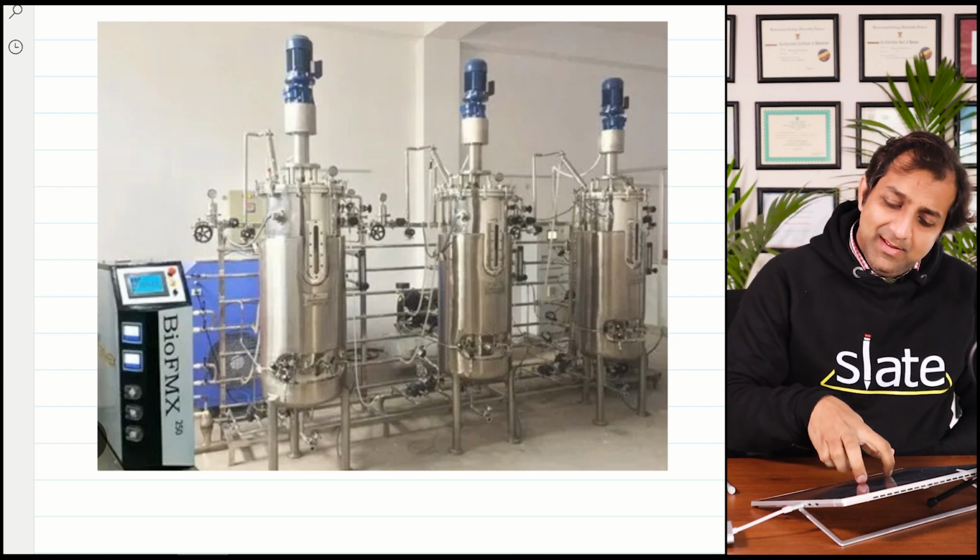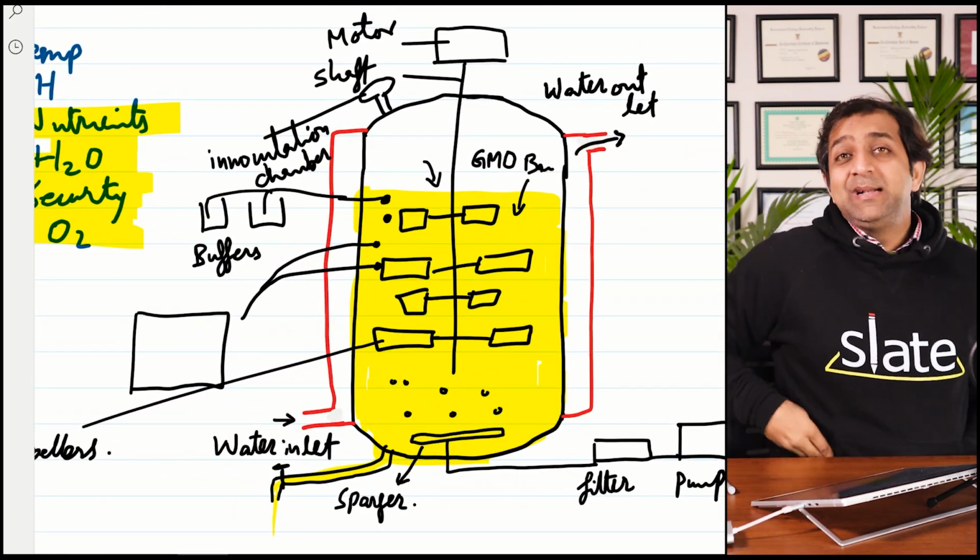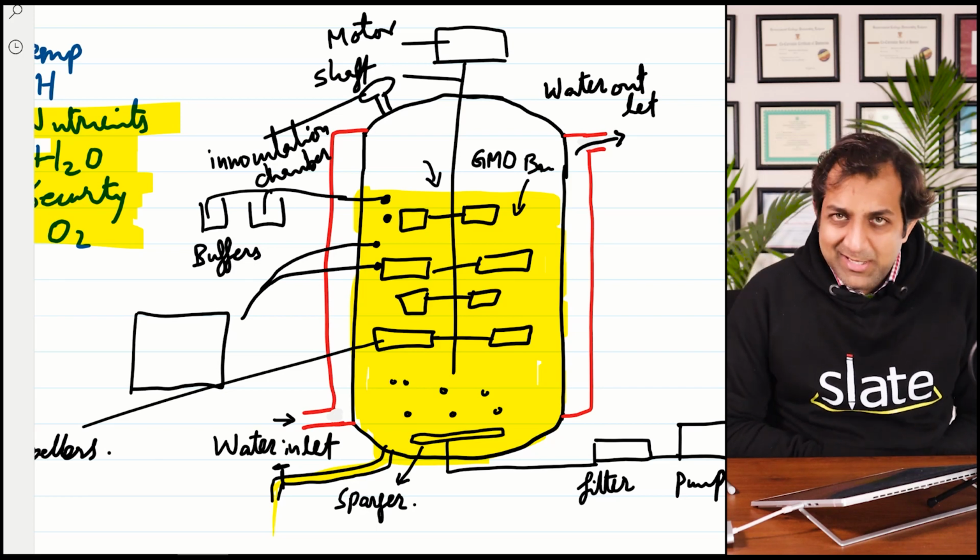But still, this fermenter is good for you, cute and small, because at least you understand whatever is there inside.